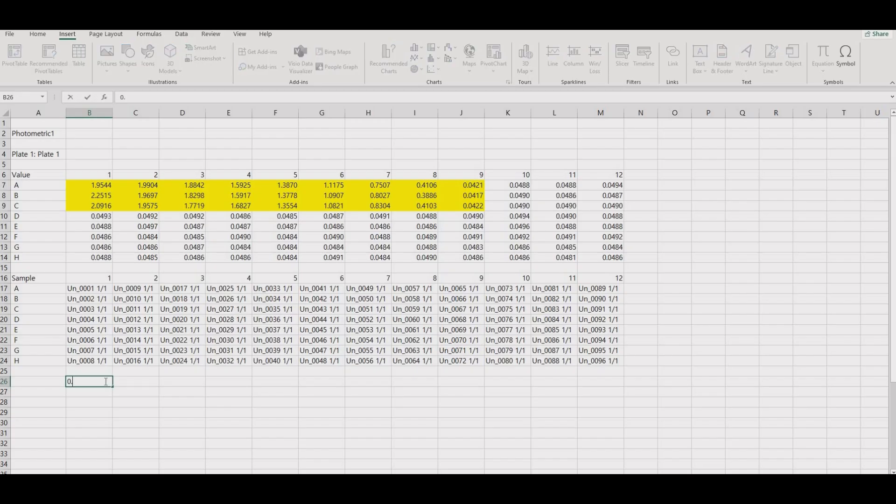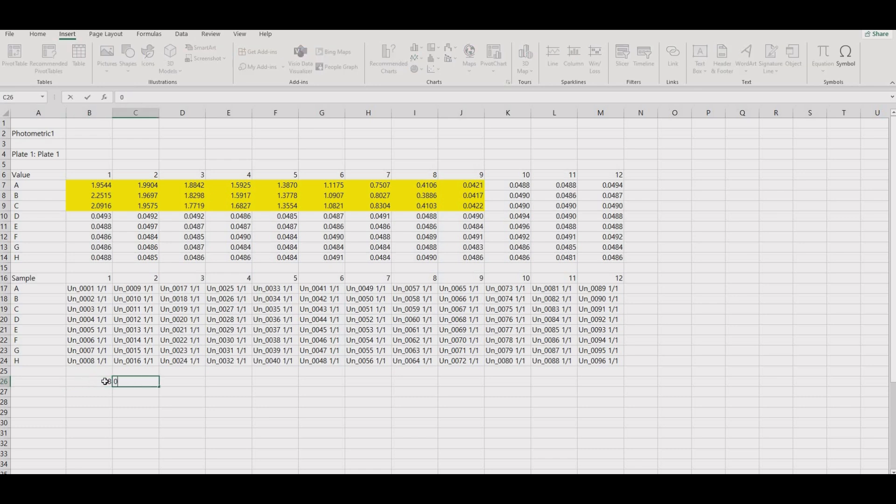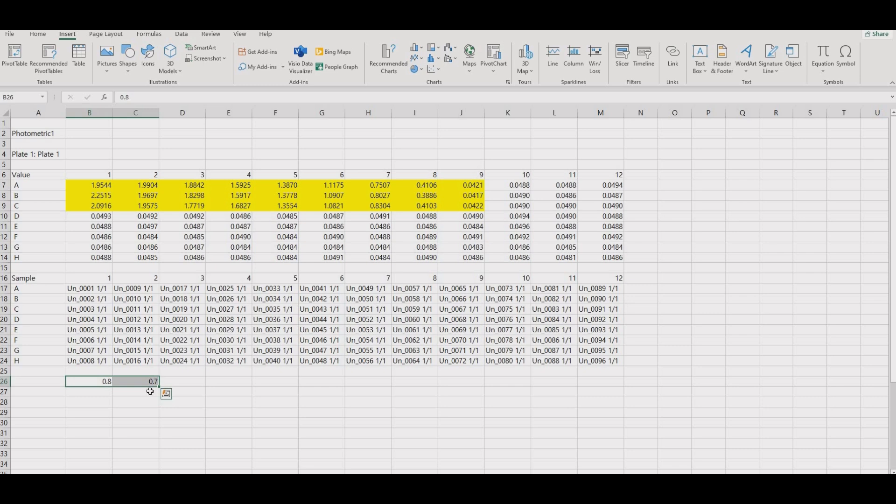So to do this, type 0.8 and 0.7. Click this box on the lower right, hold and drag all the way to 0.1, then type 0.